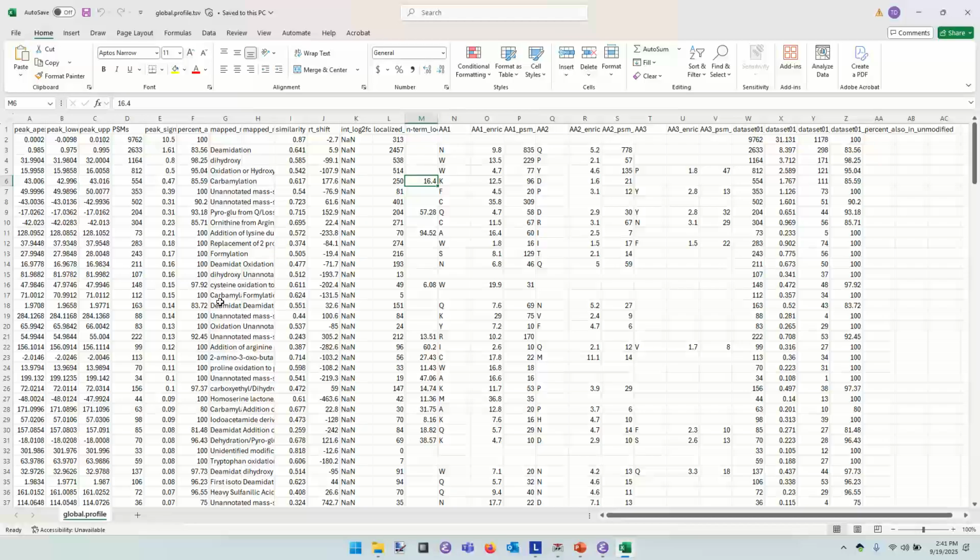So yeah, that's where you would look for your plus 43s. I think before I said it happened on the C-termini, I'm sorry. It happens on the N-terminus, obviously. And also, we see that lysine has a very high enrichment score. Why would you expect a commonality between the modifications that happen to an N-terminus and the modifications that happen to a lysine? Both are primary.